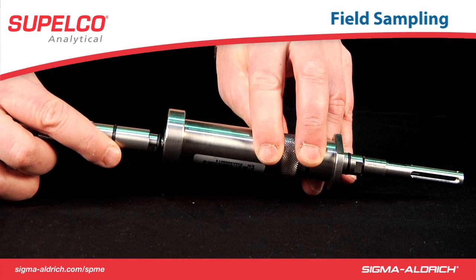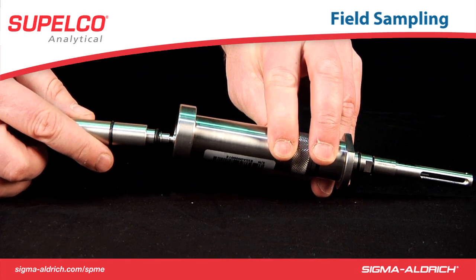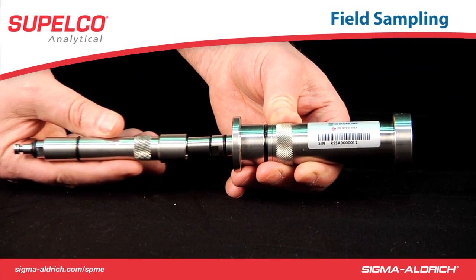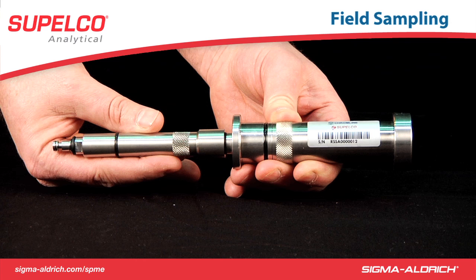After sampling, just reverse the previous steps by pulling out the plunger, detaching it from the back of the holder, and placing it back onto the plunger notch, and sliding the plunger over the needle protector to seal the fiber off. The sampled fiber is now stored safely inside the holder and can be shipped back to the lab.